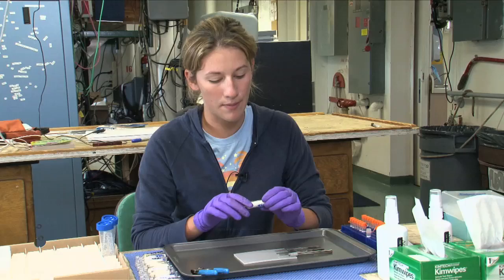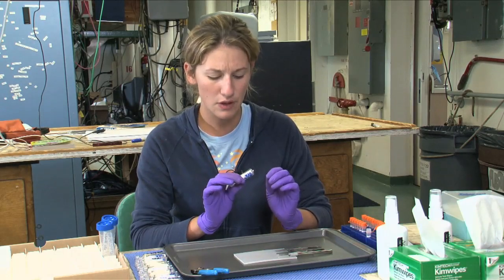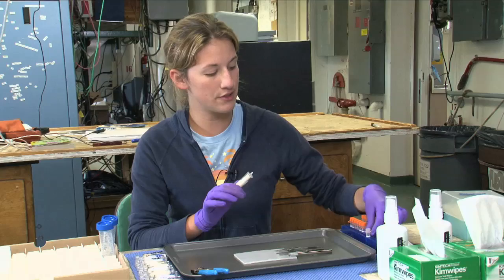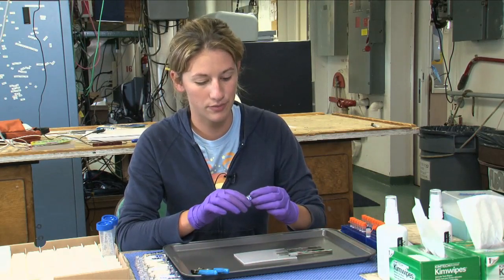But on this cruise, we decided we're going to do our first step, which is cracking this filter and putting a little piece of the filter into small 2 mil vials, so we can take them back to Maryland and finish our DNA extraction process.